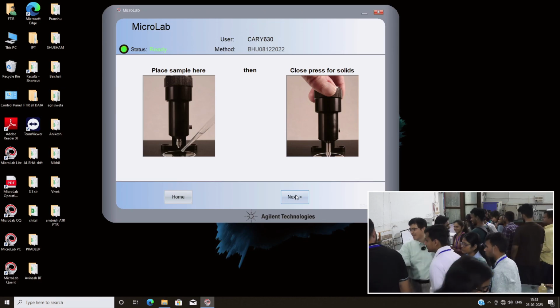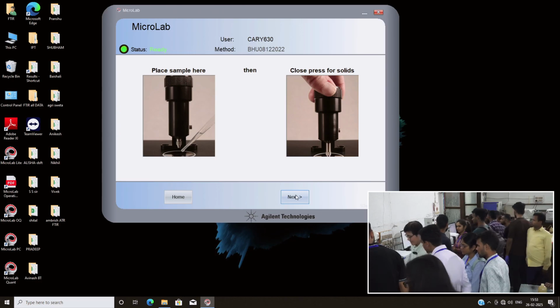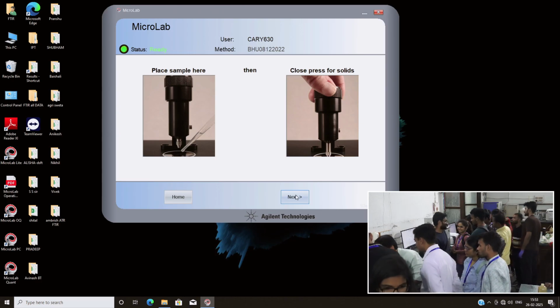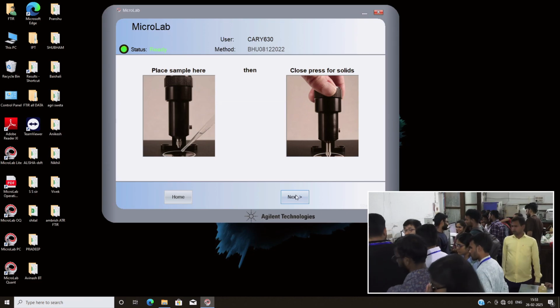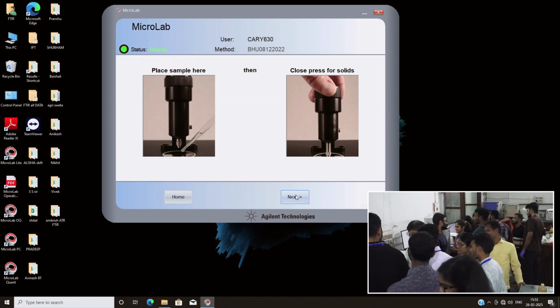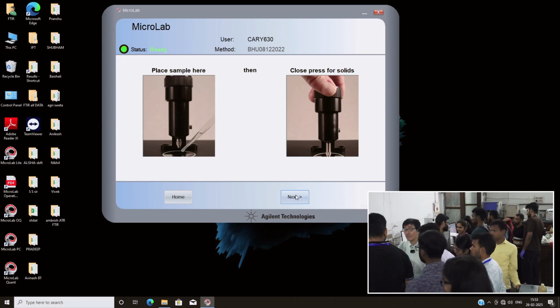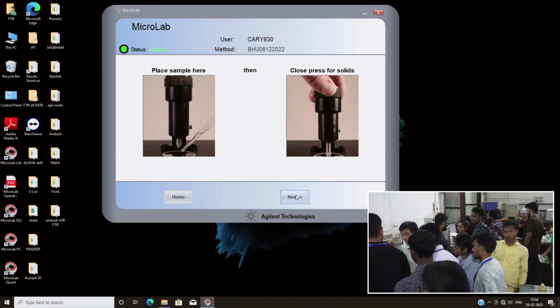We measure water. No, then we measure fructose. No, I already have data of water. Let's measure glucose directly. If this is your independent experiment, you should measure solvent and solution. And already we have the data of the solvent, so only solution.